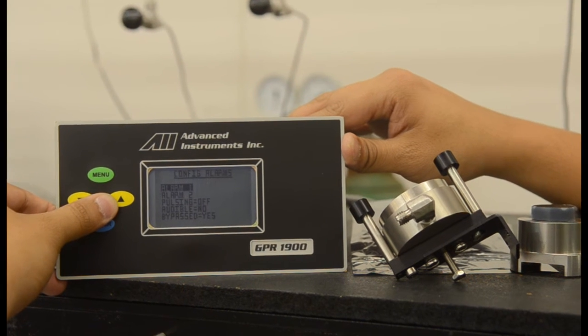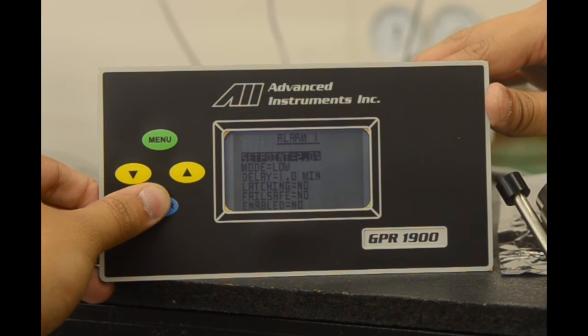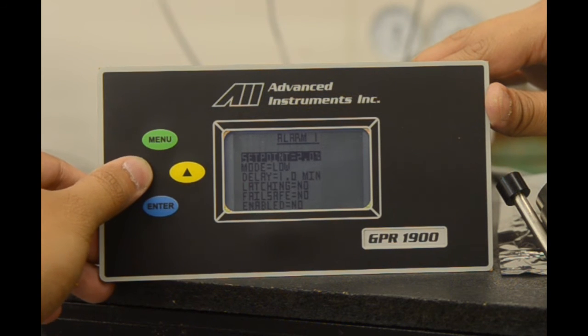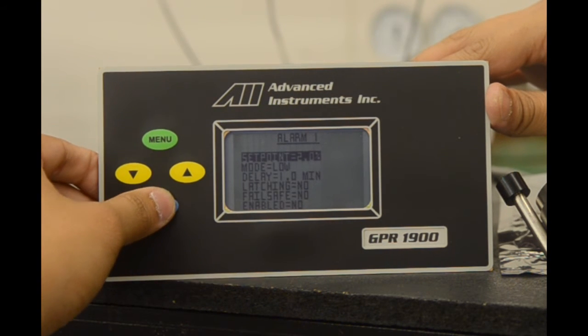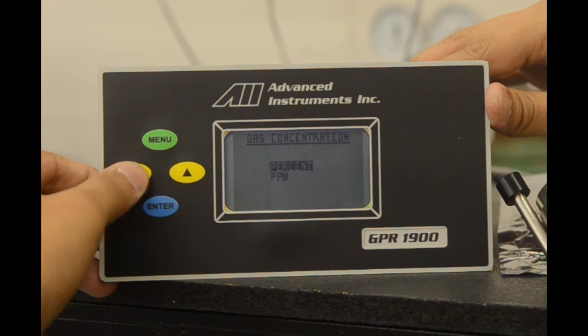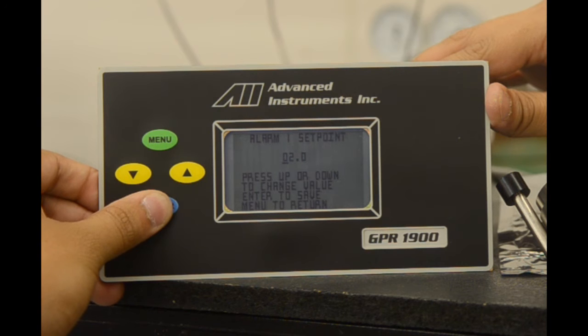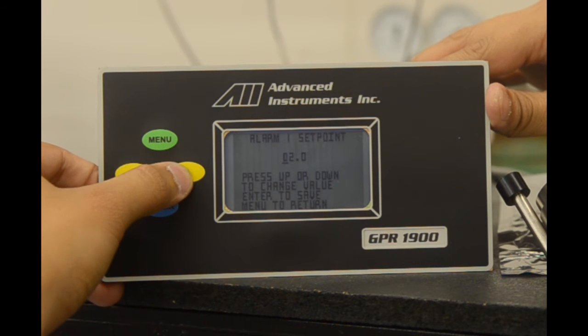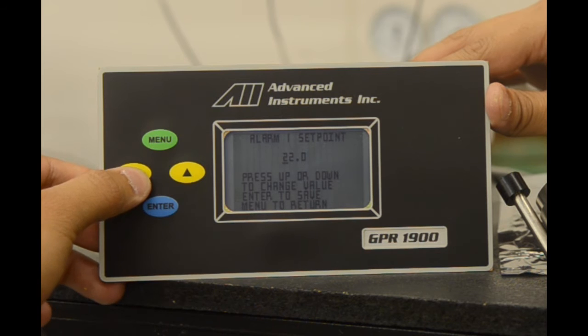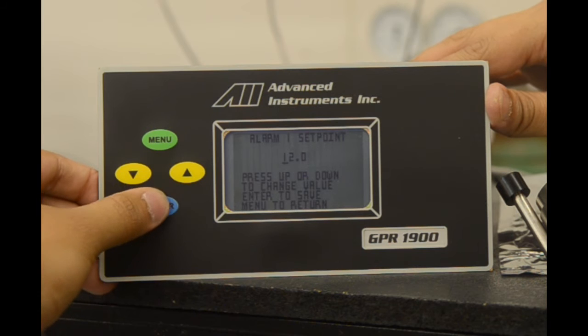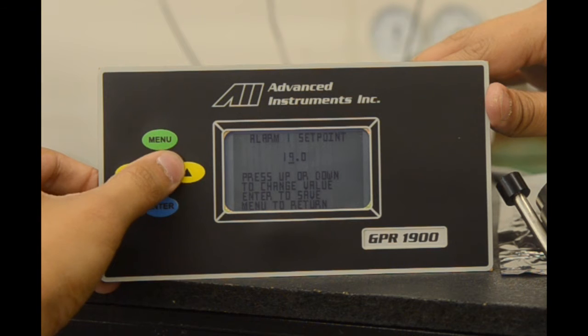We'll now configure alarm one. We select enter on alarm one and are taken to the alarm one set point menu. We will now set the set point. Select enter and you're brought to percent or ppm as an option. We will do percent. We select enter on percent and are taken to the alarm one set point menu. Here we can scroll up or down to change the value that the cursor is under. We will select 10%.